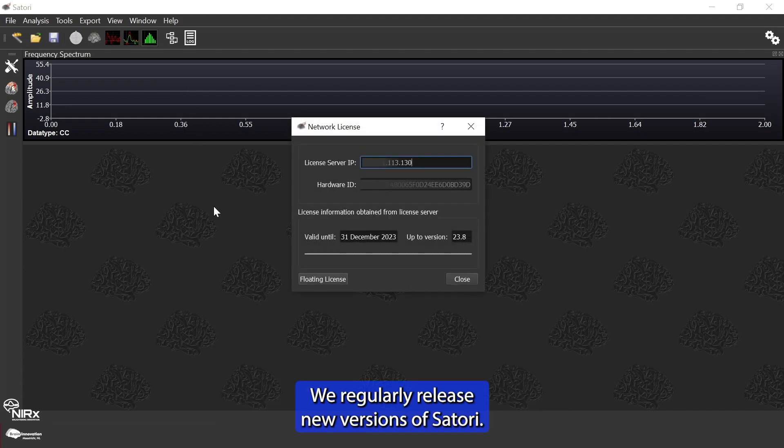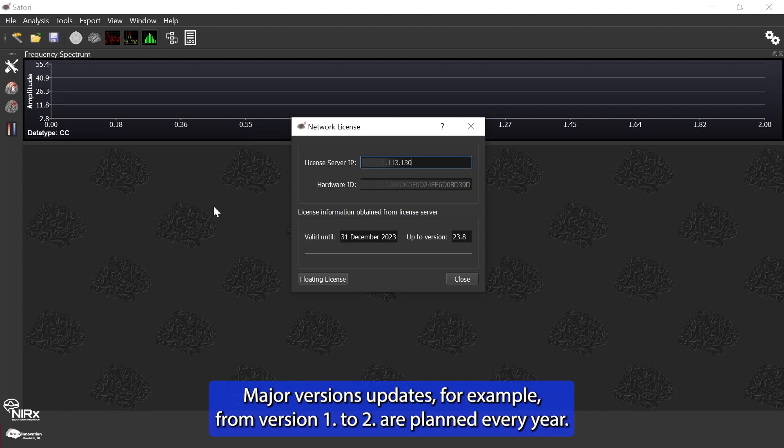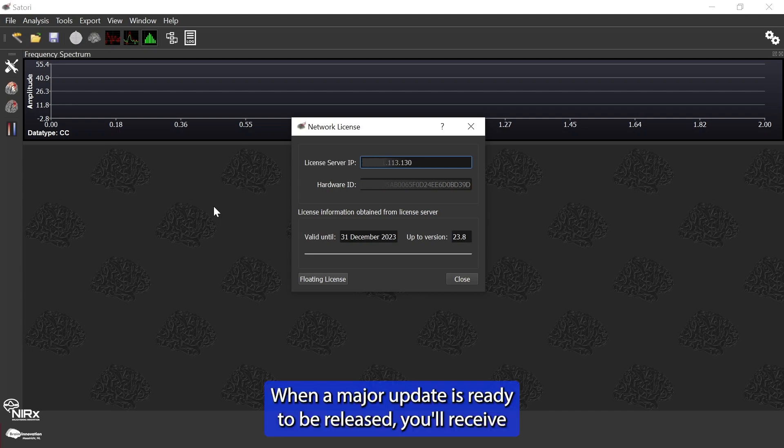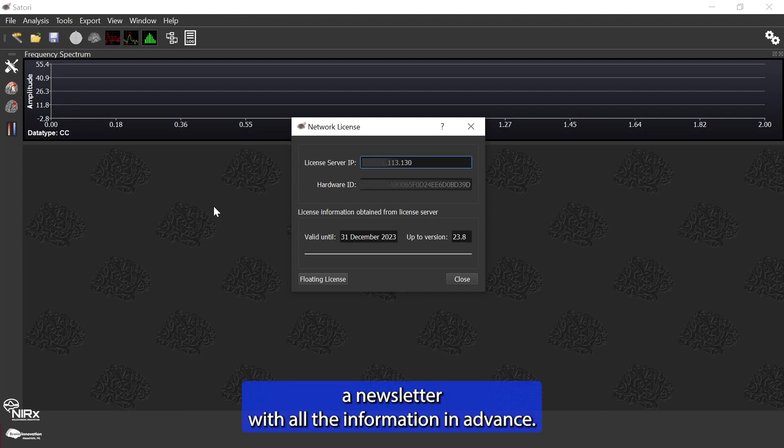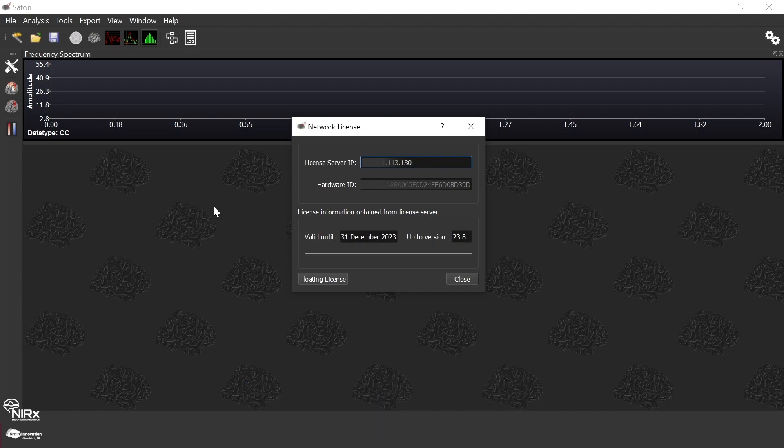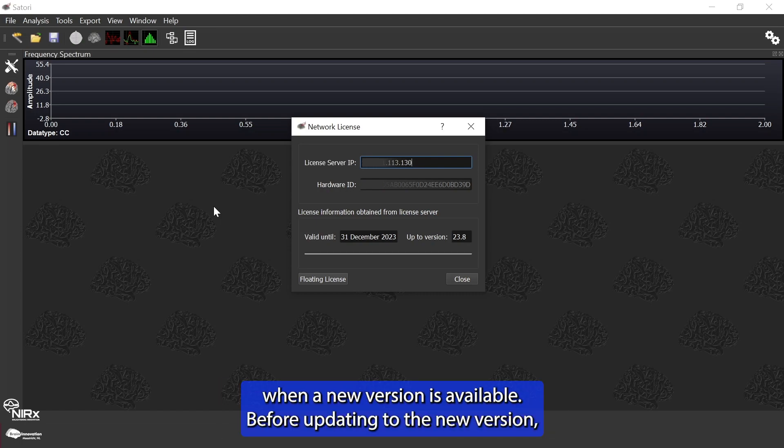We regularly release new versions of Satori. Major version updates, for example, from version 1 to 2, are planned every year. When a major update is ready to be released, you will receive a newsletter with all the information in advance. The software also shows a pop-up window informing you when a new version is available.